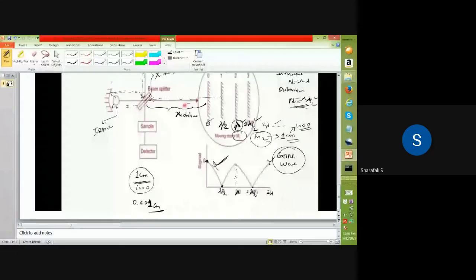Because this particular FTIR spectrometer, we cannot get that clear a picture in a single video. So you have to look into it deeply because it includes different components. It includes the basic physics, the technical part, the computational part, and mathematics. So it's a wide topic. But in order to understand it, we have to study it in a capsule, and we have to look into this.